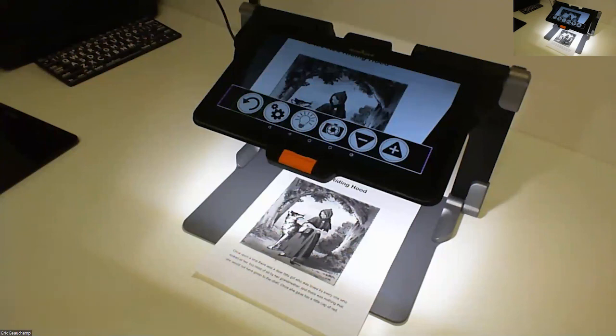Will it be running on the same version of Android? Yes, it will be the same Android version. It's still Marshmallow Android. It's just the autofocus algorithm that has changed. So we did a lot of work on that, and that algorithm is all in the drivers of the camera on the tablet.